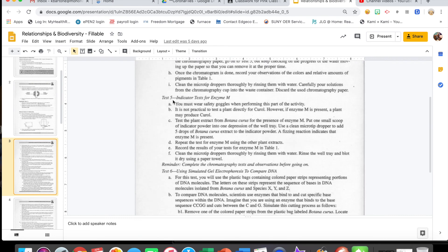While the chromatography is running, we move on to Test 5 on page three: an indicator test for Enzyme M. Remember from our DNA unit that enzymes are a type of protein made in the ribosomes, with the recipe coming from the DNA. If the DNA is the same, it will make the same protein. So the enzyme is a protein made from the DNA, and that's the relationship we're looking for.